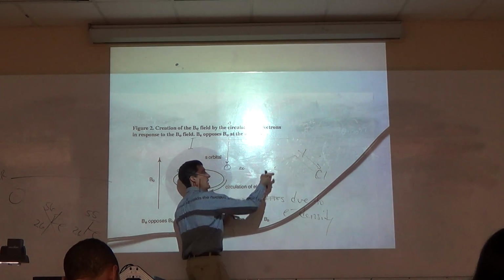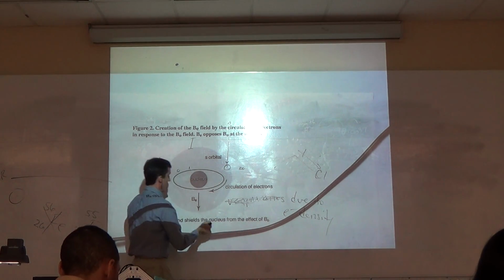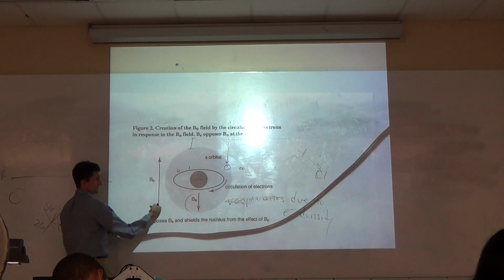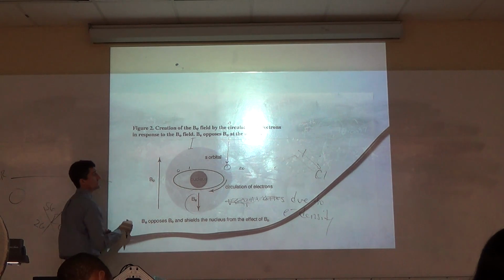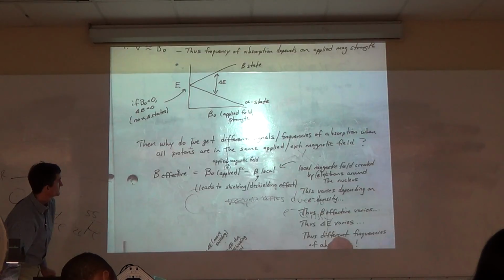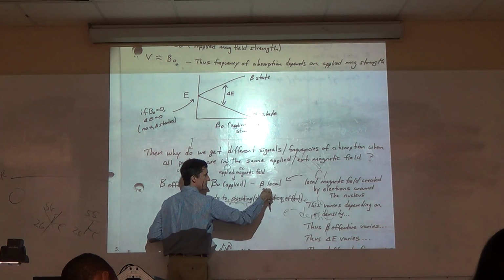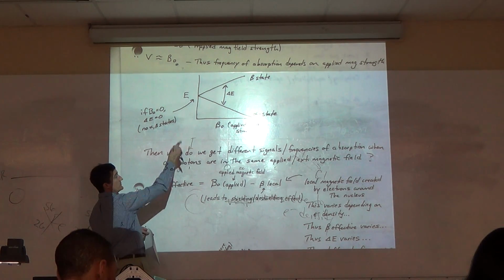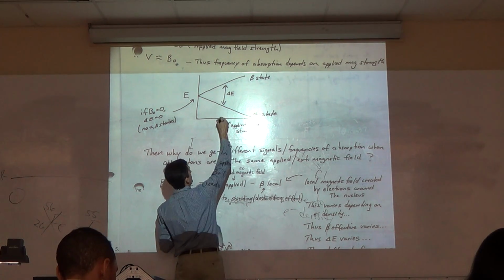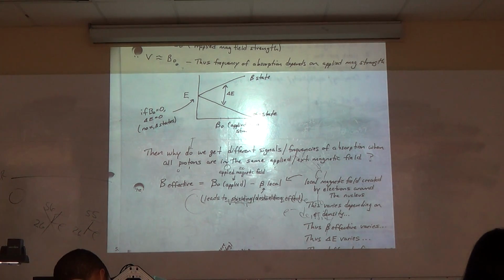Okay? We expect two signals. Why? Because they have different electron density. That's going to make this vary. Because that varies and that adjusts this, it's going to adjust it two different ways, or two different amounts. Basically, that's constant. This varies based on electron density, essentially. Because that varies, what the nucleus actually senses varies. And because it varies, you end up with different places on that magnetic field, and thus you get different signals, because you have different gaps.